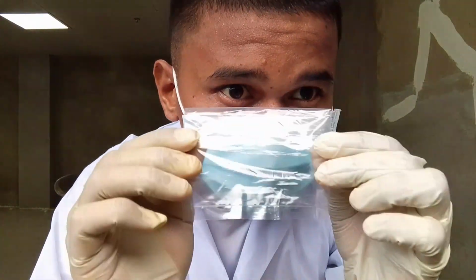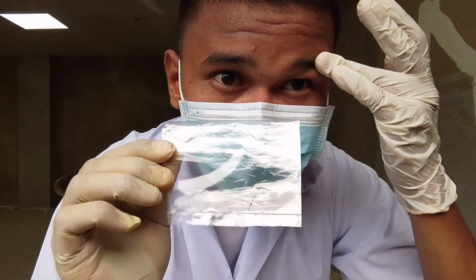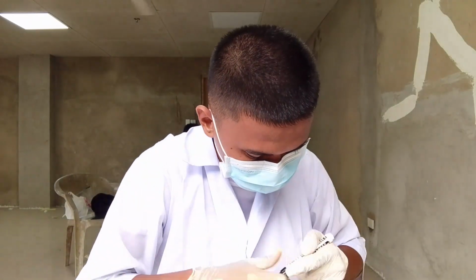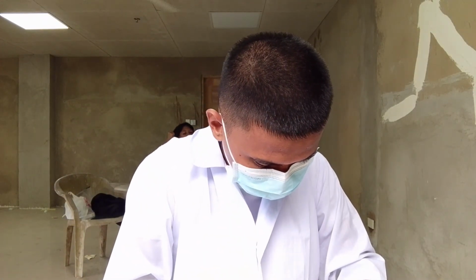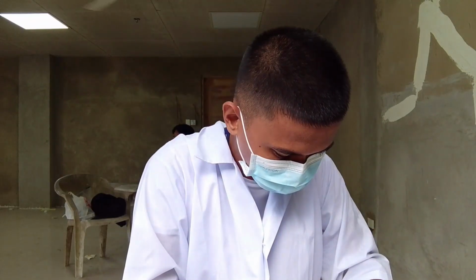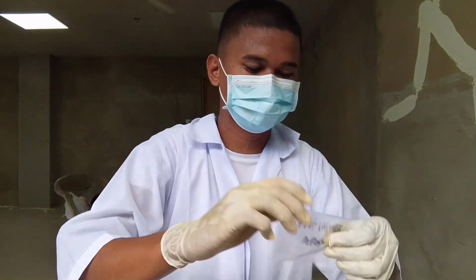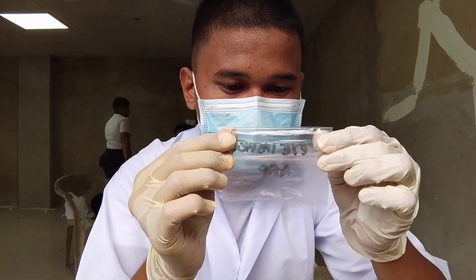I am now done collecting the eyelashes, so I will now label it.